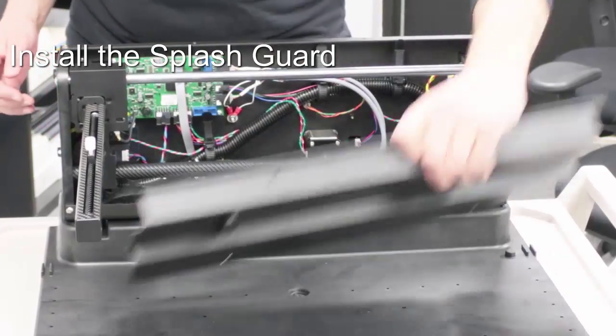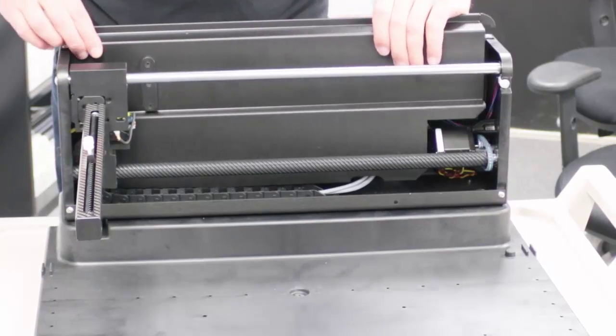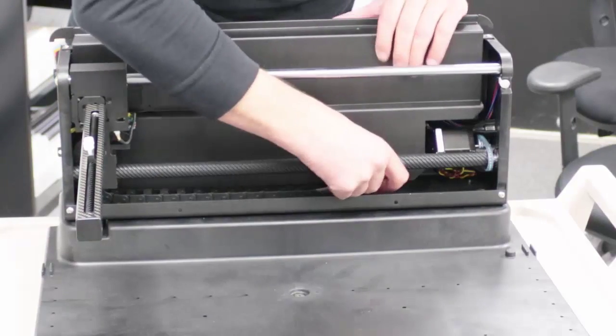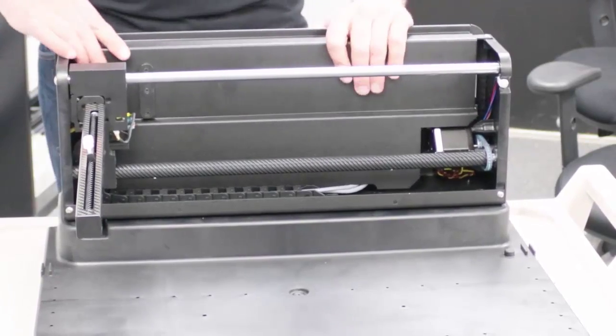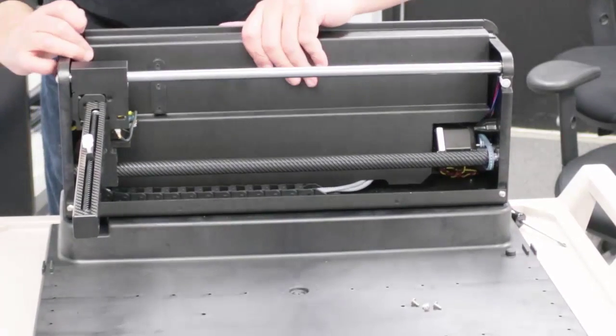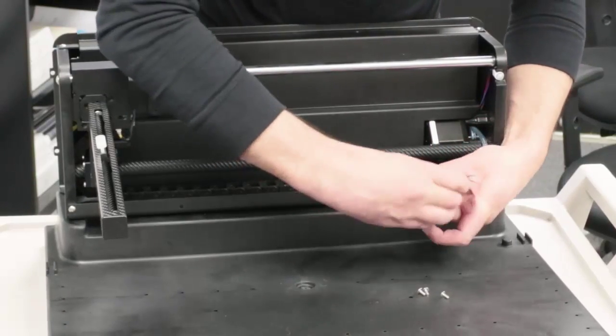To reverse the process, move the Y arm all the way to the left. Then slide the splash guard and rotate it down. Install the four screws loosely, then slide the Y arm all the way to the right.